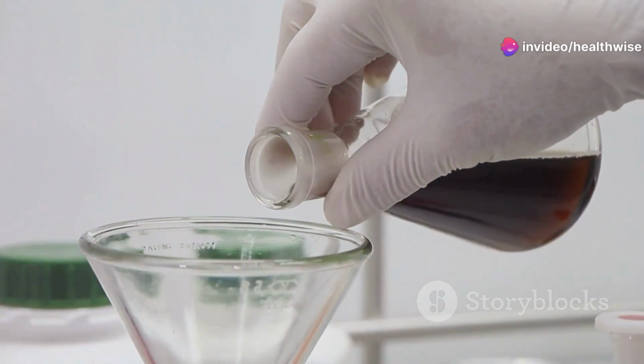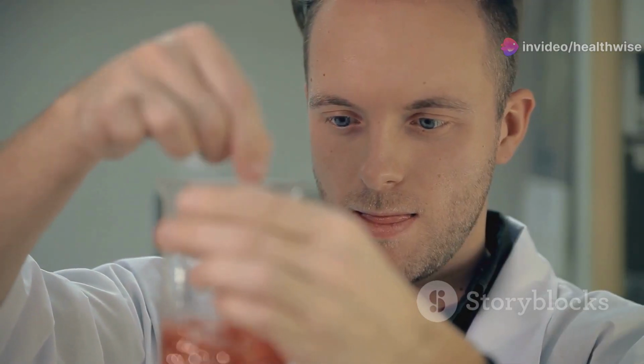Now here's where the exchange part comes in. We can introduce a special solution that changes the charge of either the resin or the molecules. This change disrupts the attraction, causing the molecules to break free and flow out of the tube.